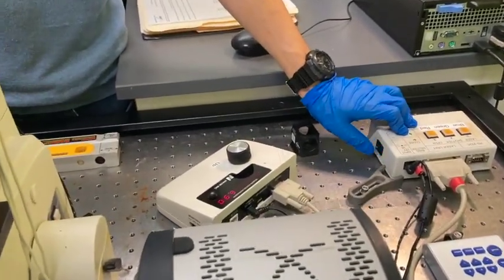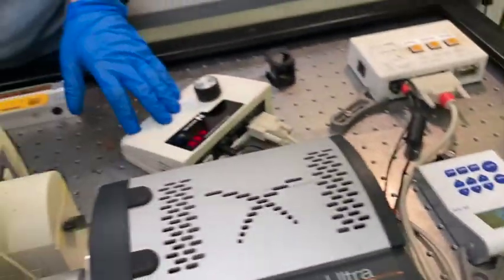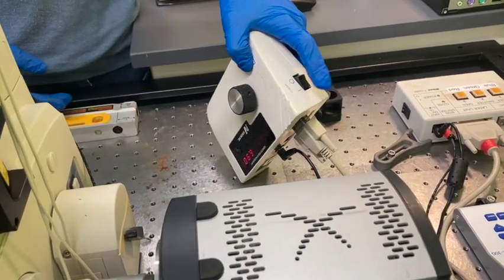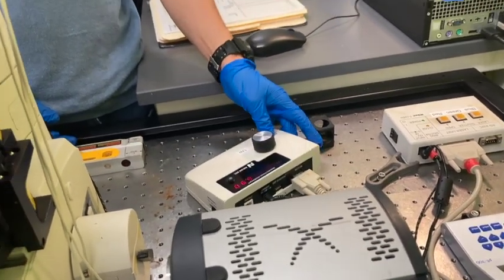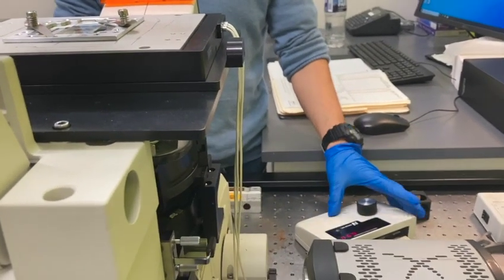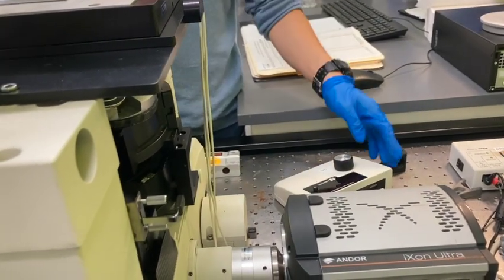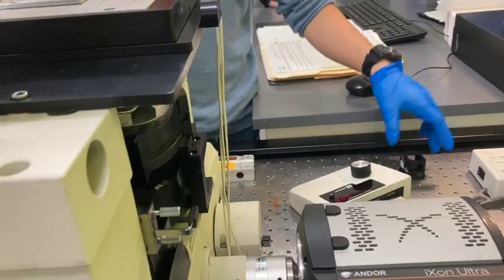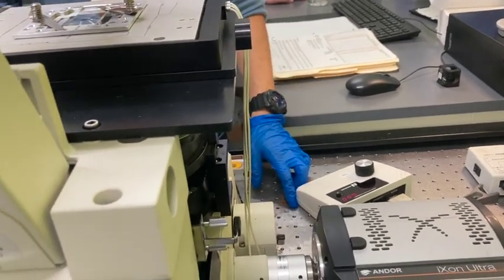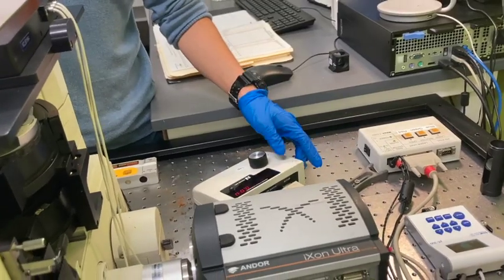So this is safe. If you have IRM, just turn it off. So this is the on and off switch, and this is for the stage. I know there is also a switch over here. I normally leave it on. This is also okay because we will have our main power turned off. But remember, if this is not controllable, which means somebody already turned it off, even if you have the main power. I mean, I just made it complicated, but just make sure the switch is on. This and this are safe to leave switched on.